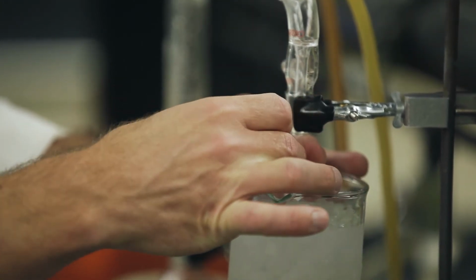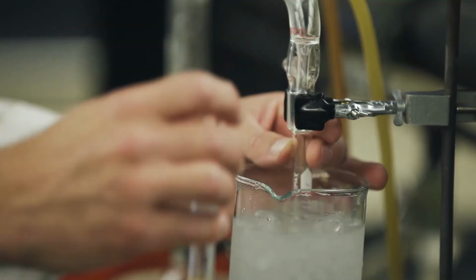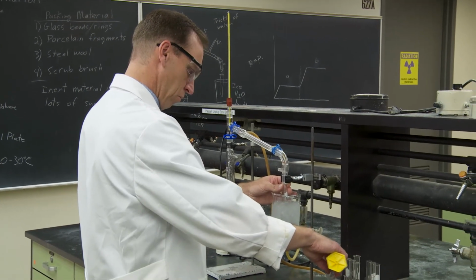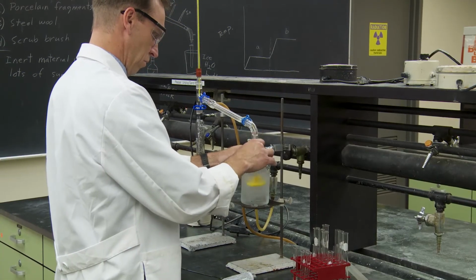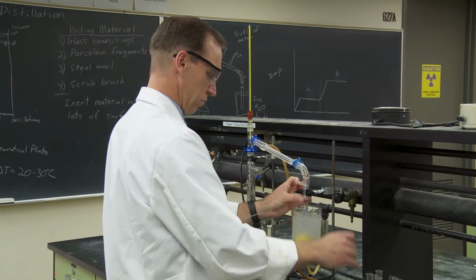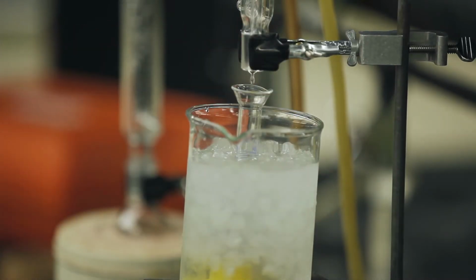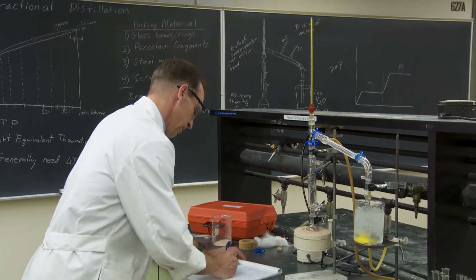Okay, and well, I really need to put this in here. Okay, and we'll keep track of our temperature. We're about 43 degrees.